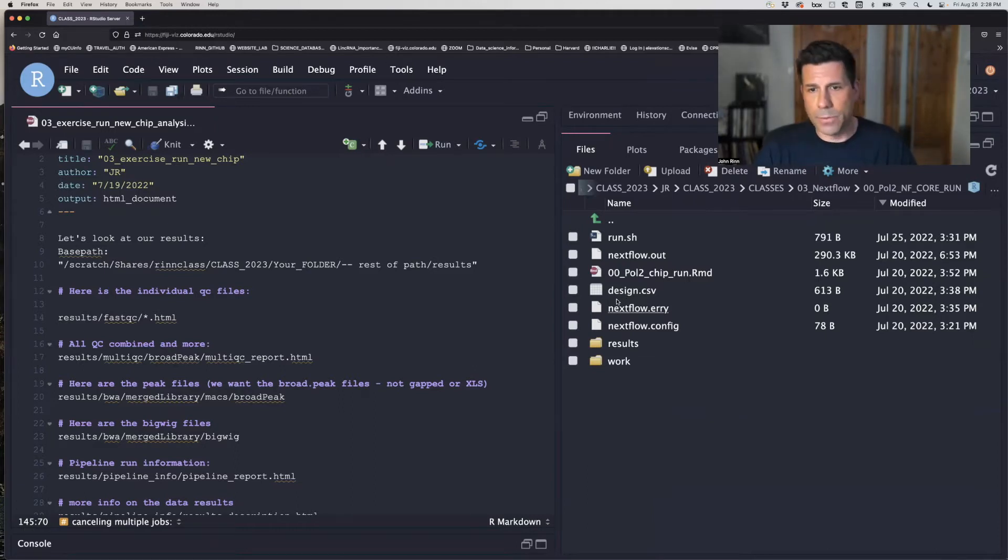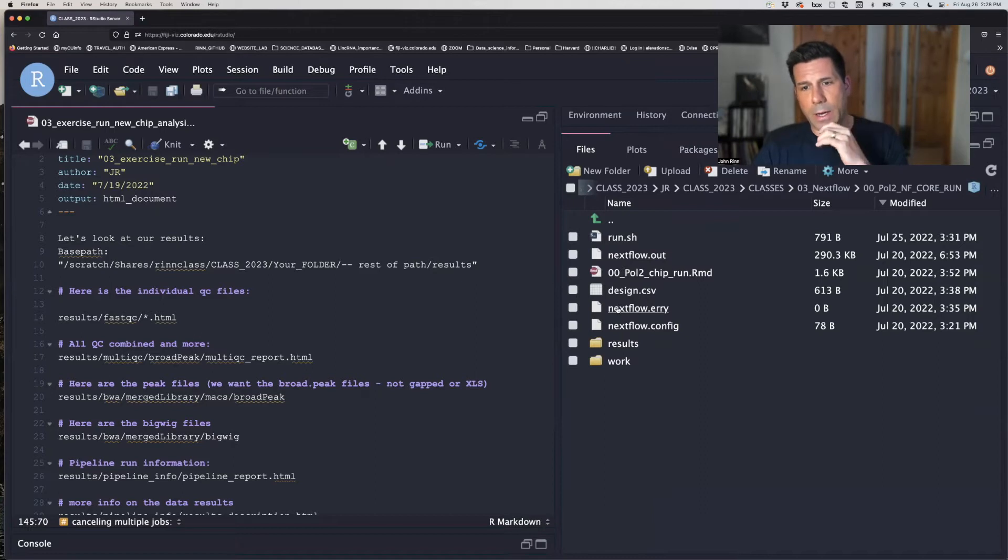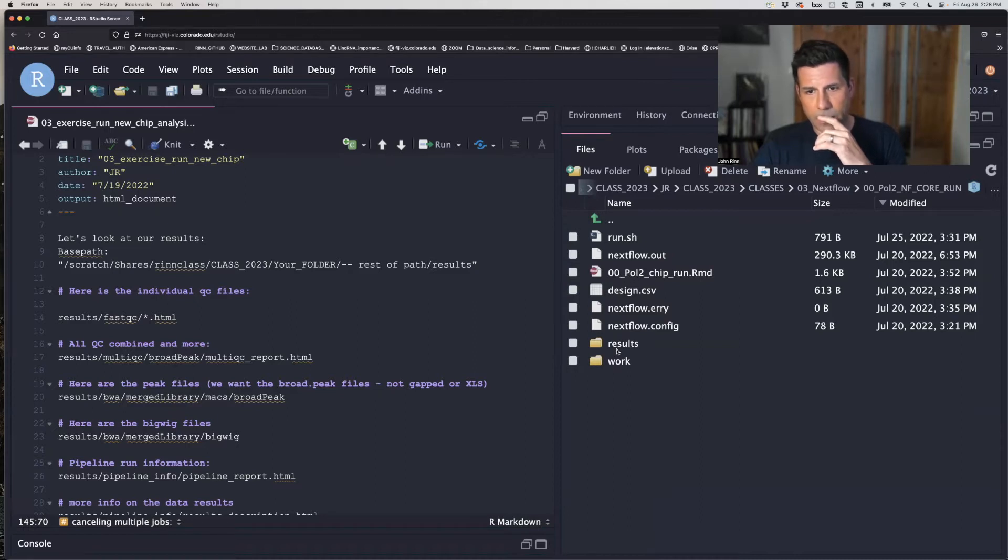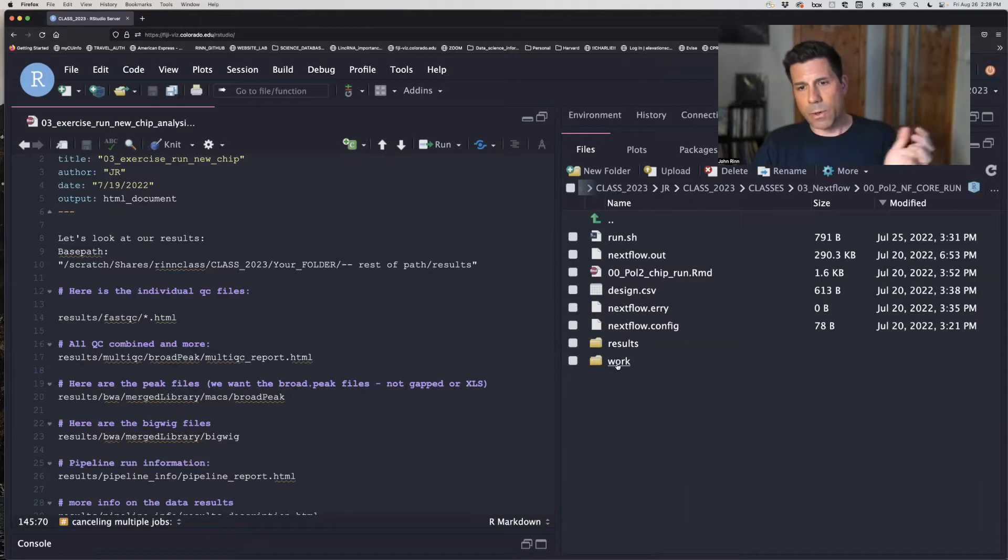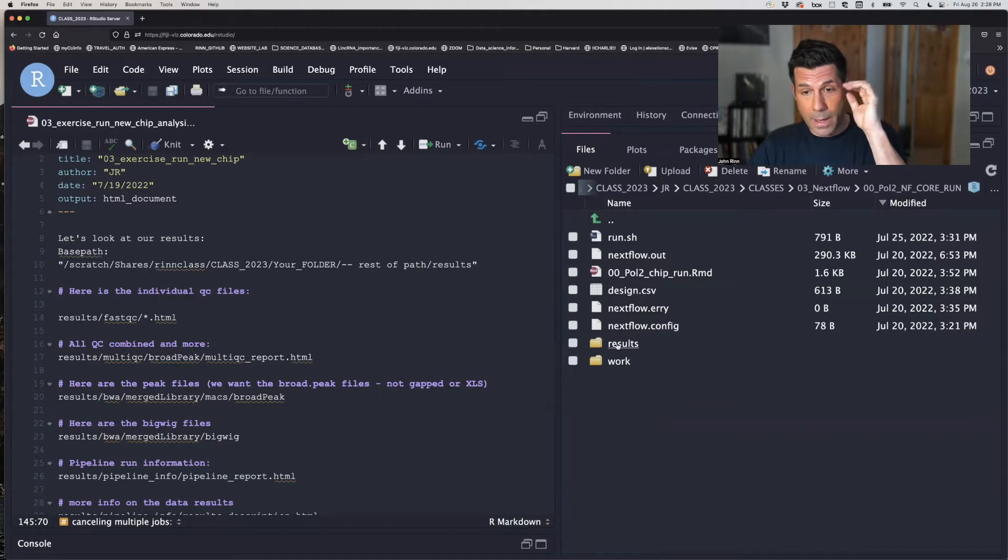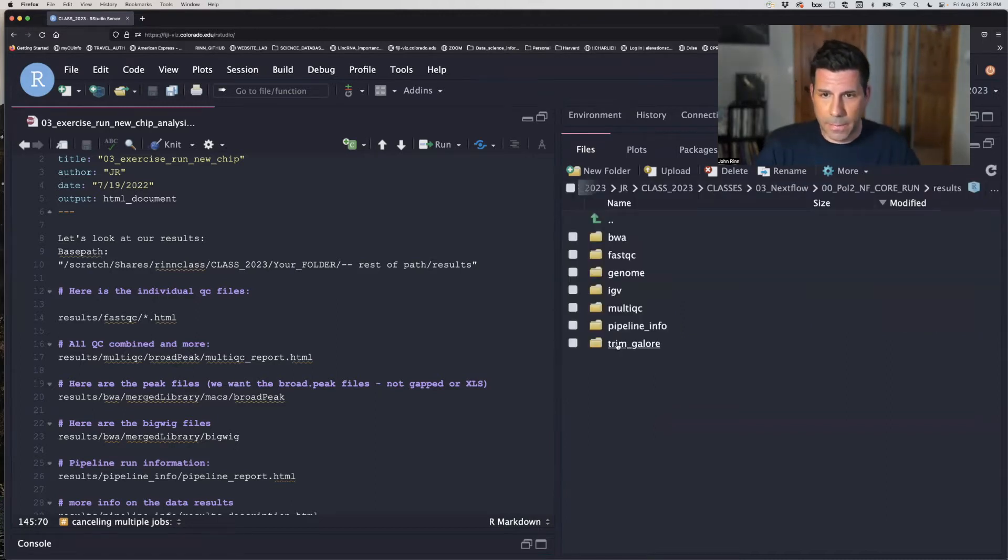So there's our design file, run.sh, Nextflow out, and error. That's what we did, and we got a results folder and a work folder. Work folder you can pretty much remove at this point to save memory. And the results are in here.